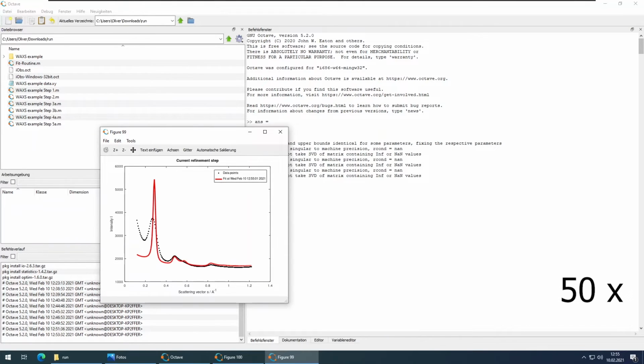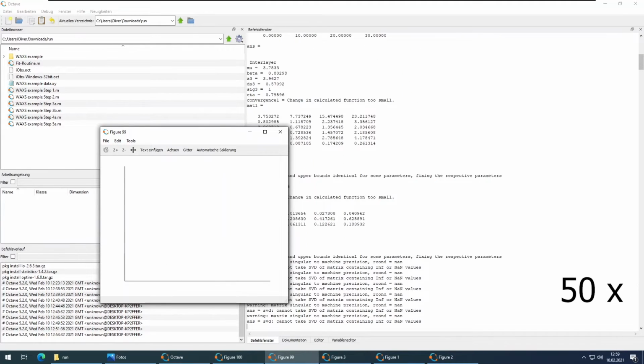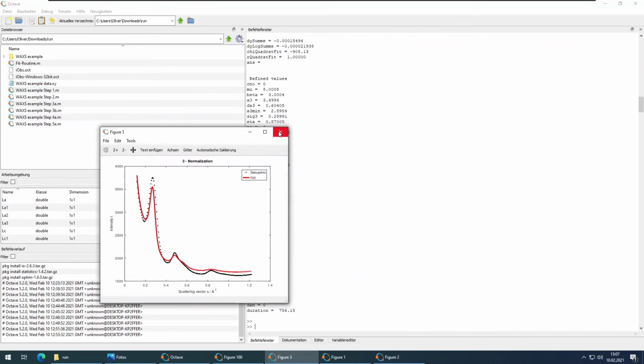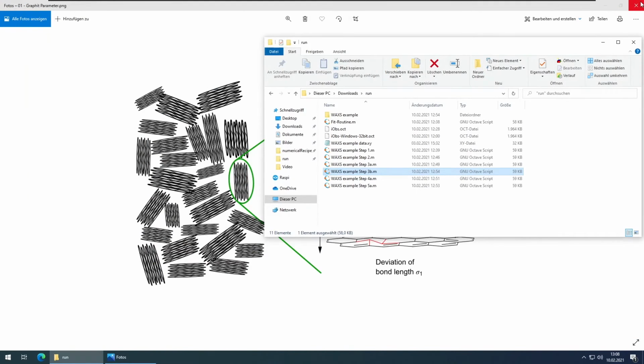The script now refines the data fully automatically in the same order in which it was done manually. Images of the result, the deviation between measured and calculated intensities, and images of the individual fit levels are output. They are also saved on the hard drive.